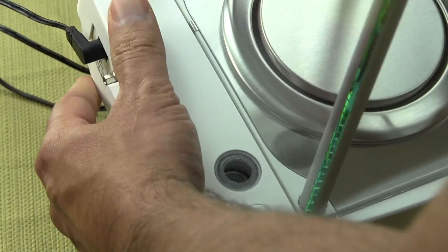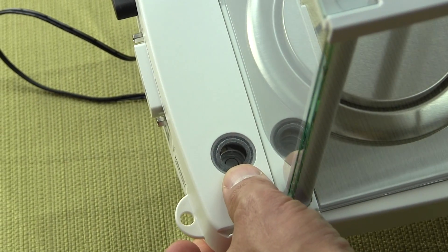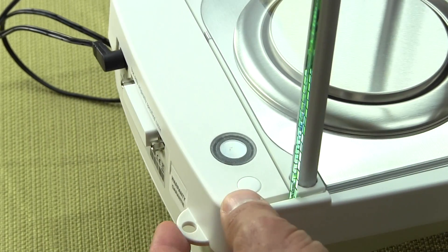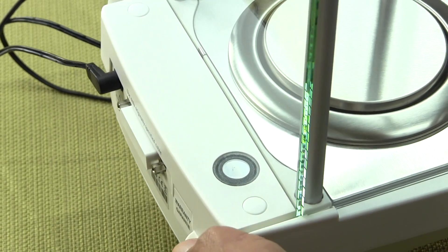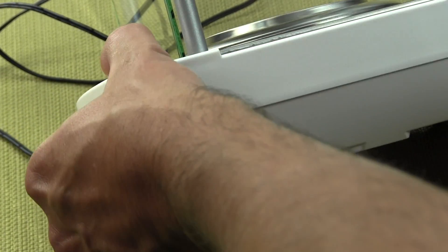That's the rear of the scale. And also, you have here in the lower corner, this is a spirit bubble indicator to enable you to level the balance. At the very rear, this little hook here, this would be to put a lock on if you wanted to lock down the balance in your laboratory.